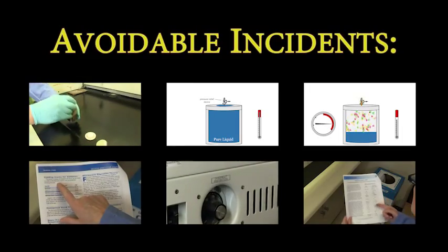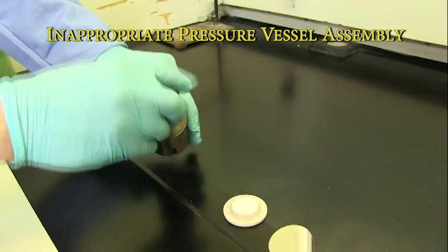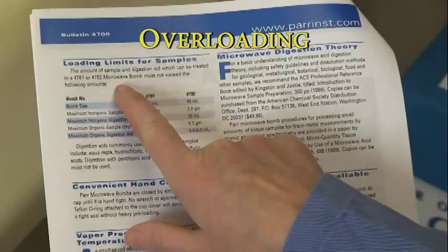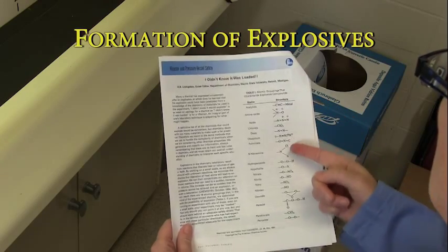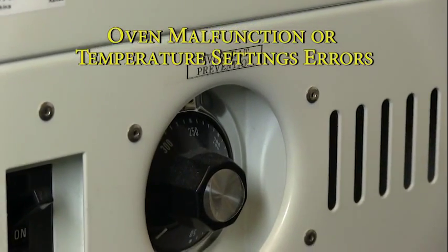The following factors have contributed to avoidable incidents: inappropriate pressure vessel assembly, liquid overfilling, filling with incompatible chemicals, overloading, the formation of explosives, and oven malfunction or errors in setting oven temperatures.